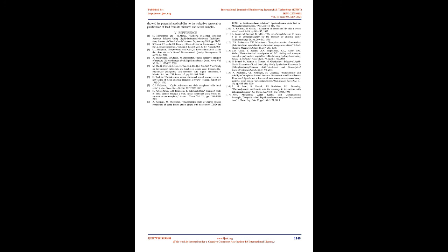After 3 hours of experiment, more than 92.10% of Pb(2) ions had been removed by this extraction procedure. Back extraction optimization was also successful, with 94.12% of Pb(2) ions removed from the dichloromethane organic solvent layer with the same ligand.